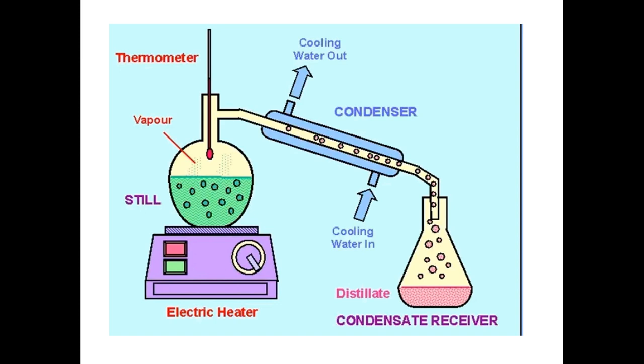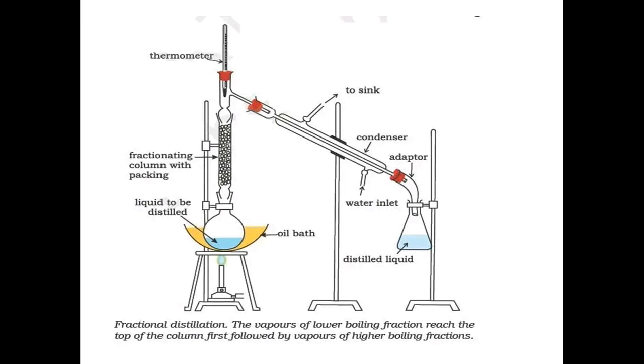You basically have two types of distillation. You have simple and fractional distillation. Both have similar setups but have slight differences in terms of their functions and uses. So let's begin with simple distillation and then we go to fractional distillation.